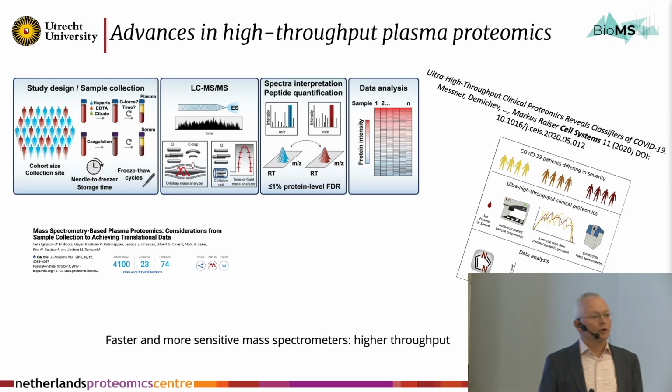Now, what I'm not going to talk about, we also do a bit. There's a big movement now in mass spectrometry and mass spectrometry-based proteomics to measure as many proteins as possible, for instance, in someone's serum. And this can be done now relatively cost-effective. So you get a few drops of blood, and within an hour or so, you can measure the level of all the proteins in the blood.